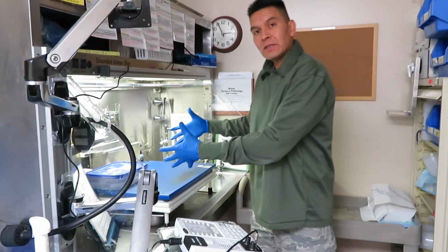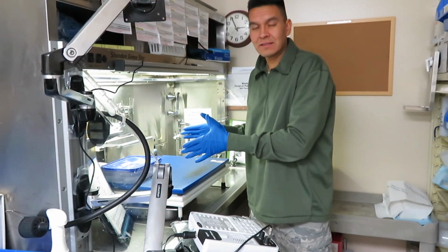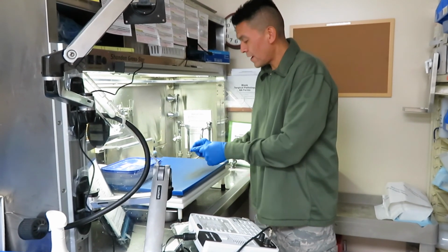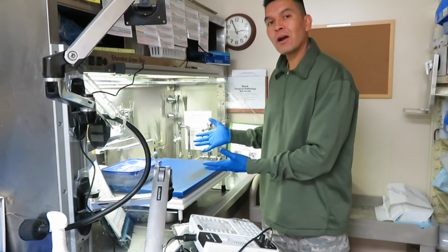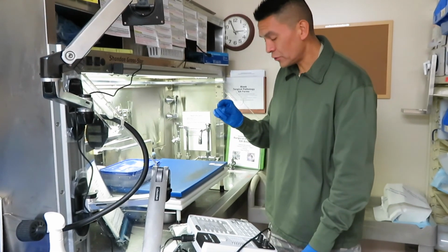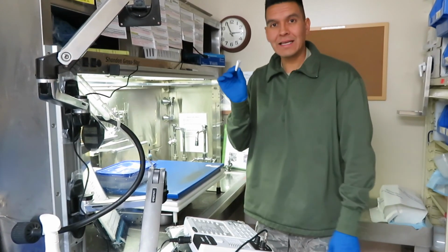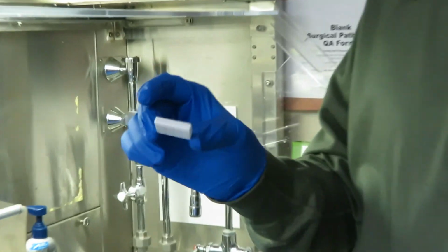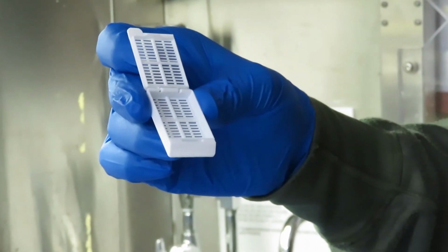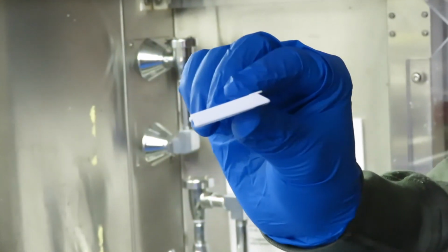If it's a big specimen, we take it out, we look at it, we look to where anything looks diseased or different, we cut into it. I know it's kind of hard without an actual specimen. And then we get little pieces of the tissue and we put it into a cassette. And the cassette here is just this little 2 by 1.5 inch container, and we snap it shut.